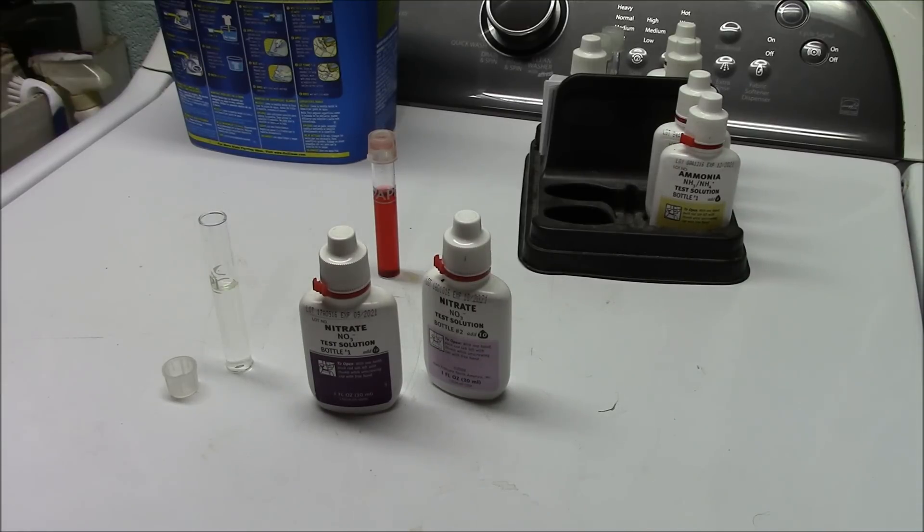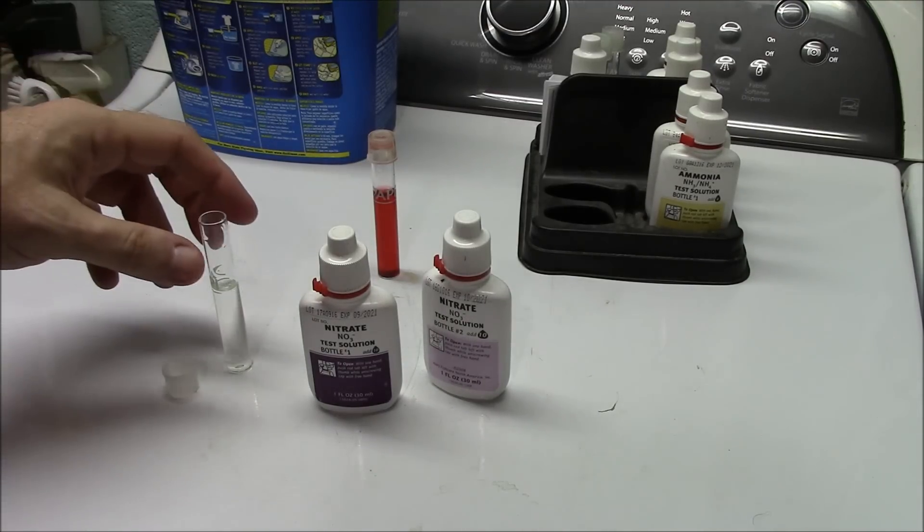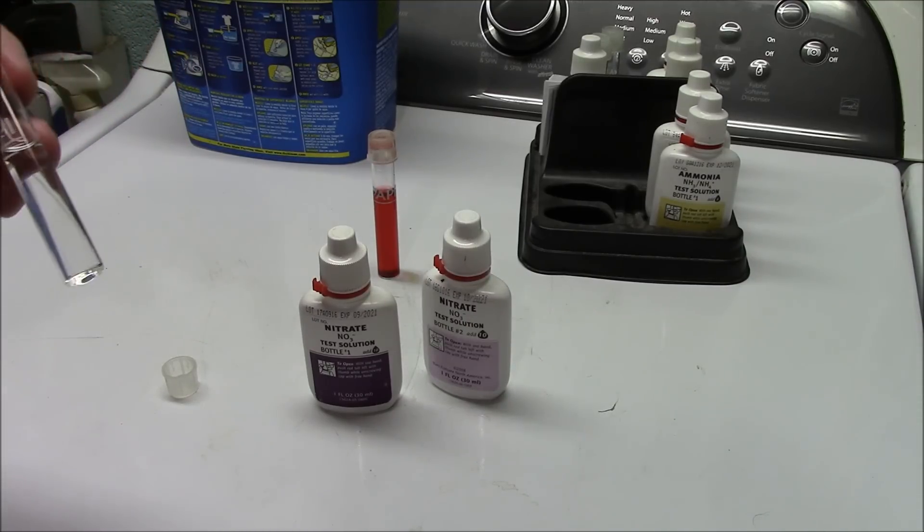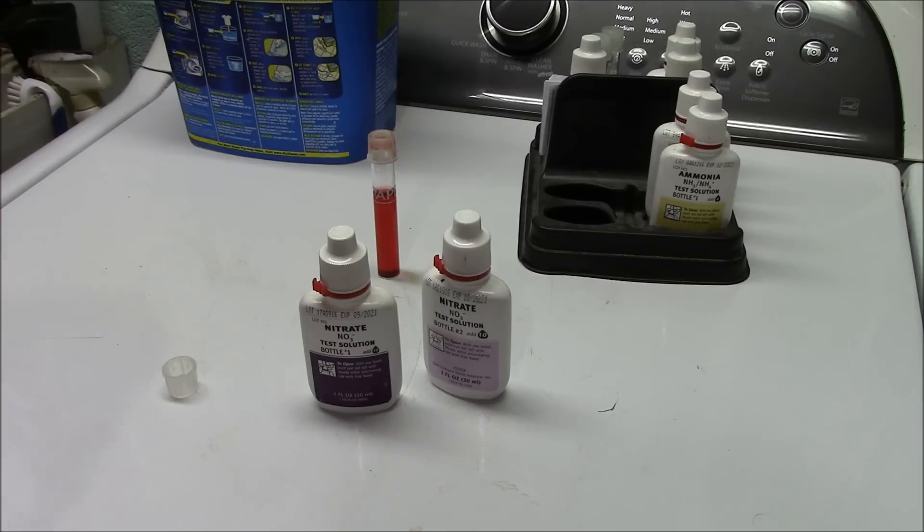We're going to check my tap water. I do have nitrates in my groundwater and my water system should take them out — I have ion exchange resin that's specific for nitrates. Sometimes if I run out of salt or it's not backwashing properly, I wind up getting some nitrates in my tap water. If I've got nitrates in my tap water and I do a water change, I'm putting nitrates right back in. Testing tap water is probably not a bad idea for everybody, especially if you've got well water like I do.